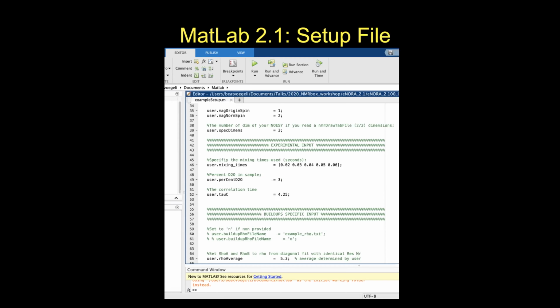So we recommend not to use too much D2O. We usually use 3%. That's really enough for, I think, most spectrometers, so you won't lose your lock. This means that you have 97% protons, and the program will correct for that.